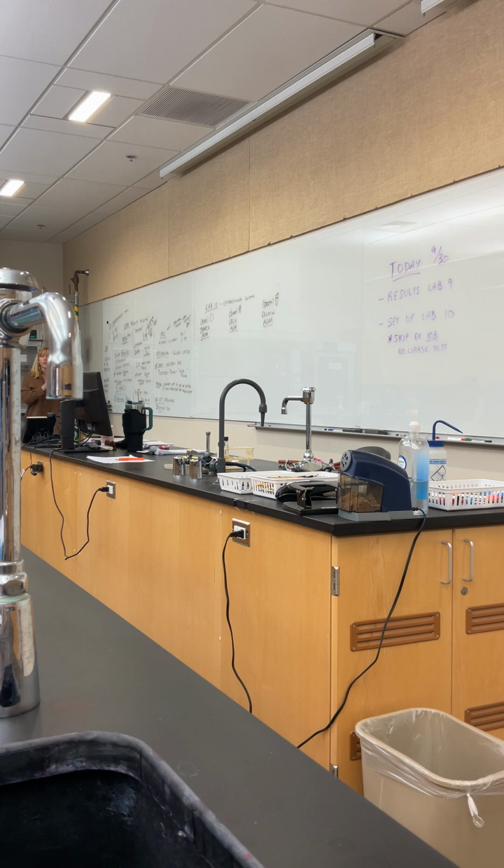Remember, I told you with the gram-positive and the gram-negative, it tells us which path to go down. It's like you come to a fork in the road, and if I'm gram-positive, I go this way. If I'm gram-negative, I go this way. If I choose the fork incorrectly, I'll figure it out pretty fast because I'm going to see some funky results on the media going forward. All right? Okay, so hopefully this makes sense.